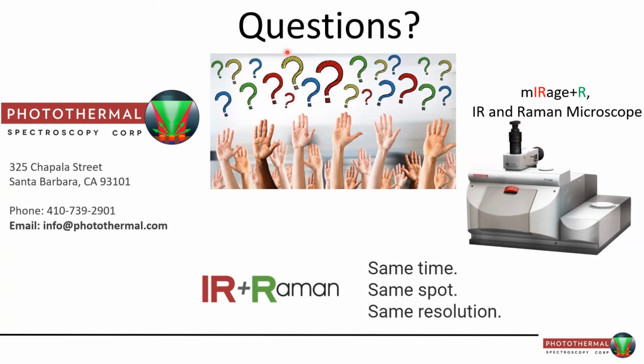This next one is probably for you, Andy. The question is, is the Raman spectral quality similar to a dedicated Raman microspectrometer? I will admit I was not 100% sure that it was going to be, but we've been very pleasantly surprised by the response. If we take a sample and put it under the Raman we've had for 5-6 years, and compare it with what we get with the Mirage, the intensity and the spectral resolution have both been very comparable. On our other instrument, we'll often use maybe 3 acquisitions at 5 seconds or 15 seconds, things of that order of magnitude, and we're able to do those just fine on the Mirage with the Raman as well.